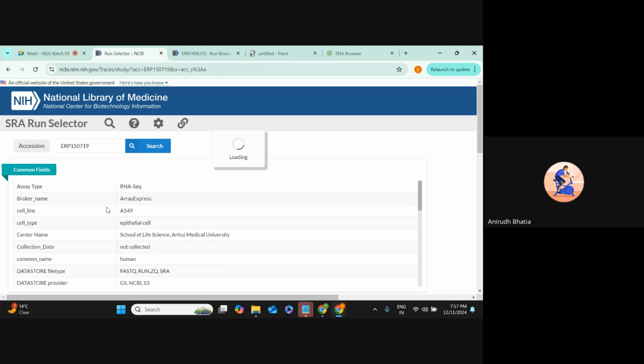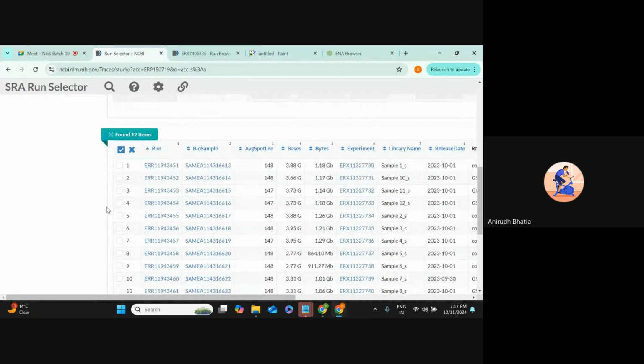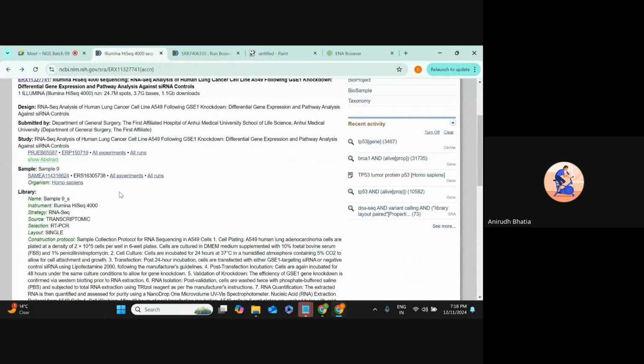Sorry, what is the difference between all experiments and all runs here? Where, sir? What is the difference between all experiments and all runs in the portal that you just opened? This one? Yeah, here, the all experiments and all runs. No, it's in all the runs. Actually, it is including the sample only, sir.